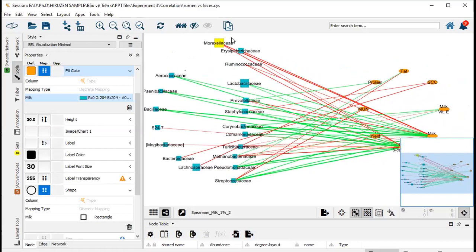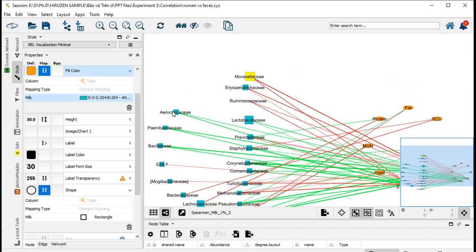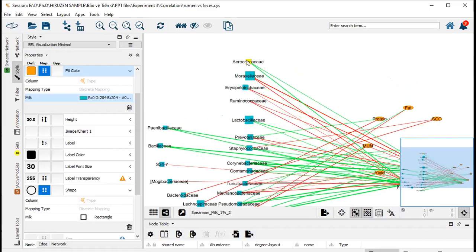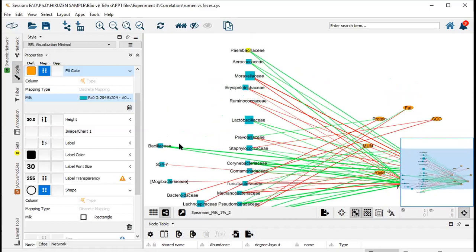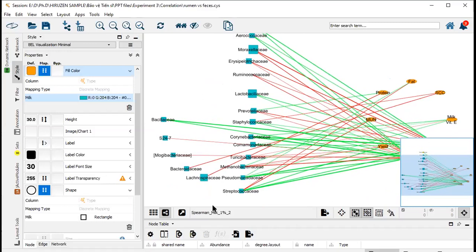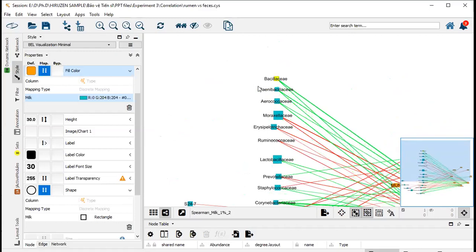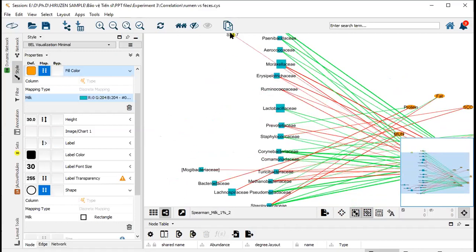But there is no way you can remove non-significant interaction. What do you mean? There is interaction. Oh, okay. Because here already show the degree. I already show this have the most interaction and this have the less interaction. Then I just keep with that order.